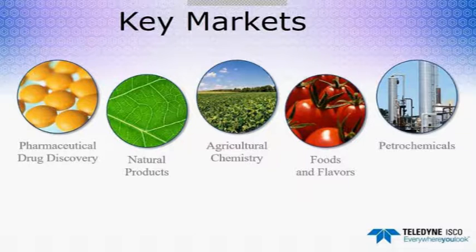Can one do soft media flash such as DE, AE, Sephadex, and also chiral flash? You certainly can use Sephadex on our columns, and we have an application note where I've run Sephadex LH20 on our system. I think we have your email address, and we can send you a link to that application note.